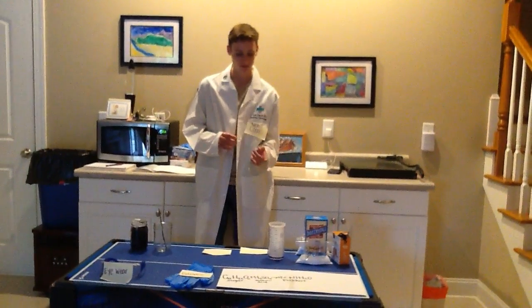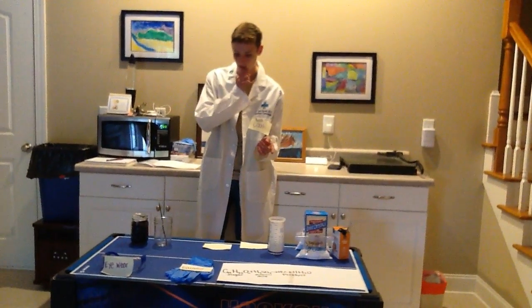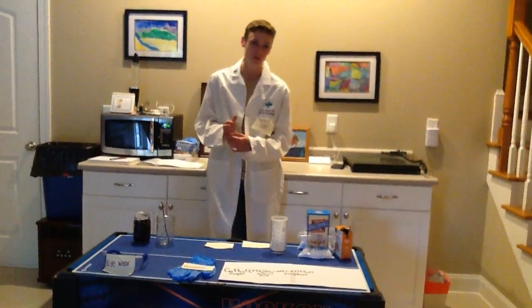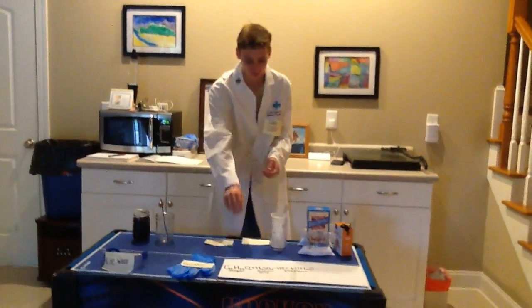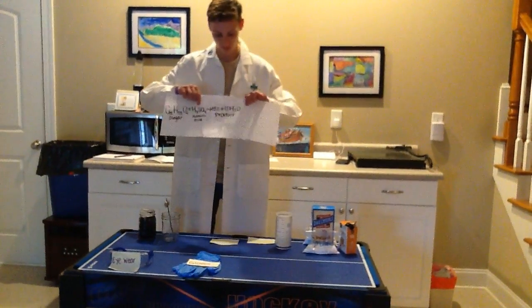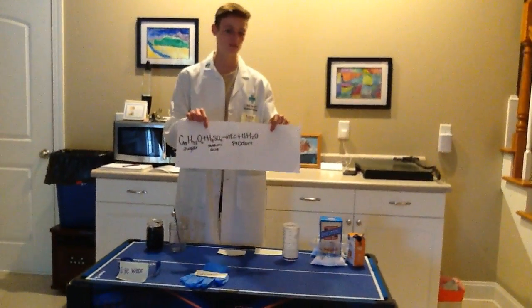Mixing sulfuric acid and powdered sugar, I'll get a product made up of H2O and carbon. You might notice in the chemical equation that I had sulfur, but the sulfur is gone. That's because it is emitted into the atmosphere.